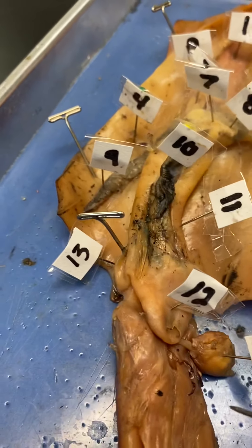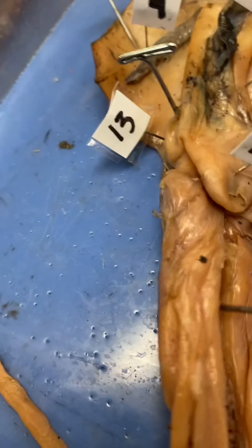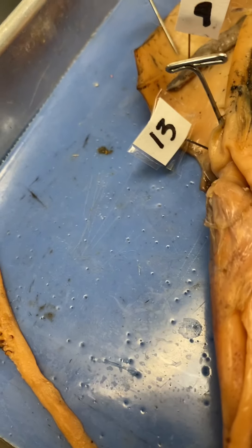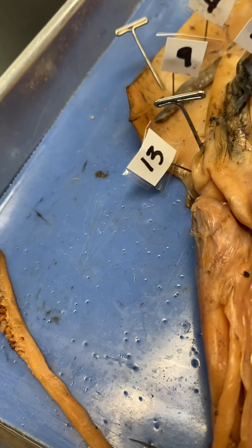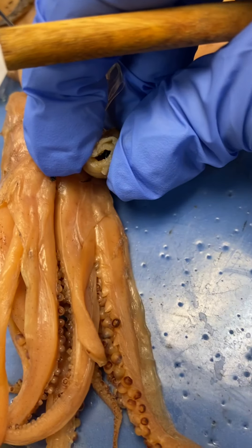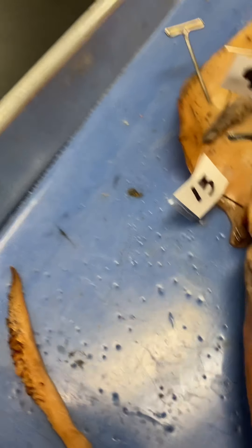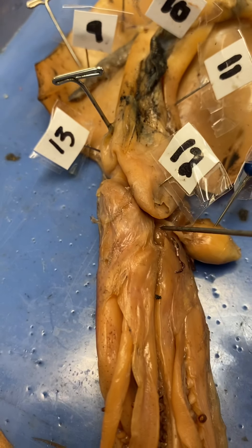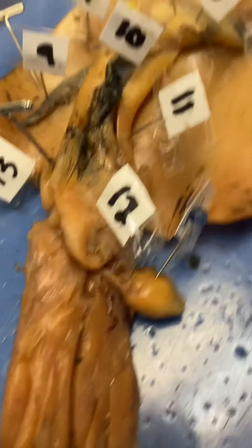The liver is really hard to see — I took it out, so don't worry about the liver. It's just a lobe underneath the ink sac. Number eleven — these are the retractor muscles that control the siphon, which is number twelve. Number thirteen, you can see it right here, is the pen — this is the remnant reduced shell — and you can hear how hard it is.